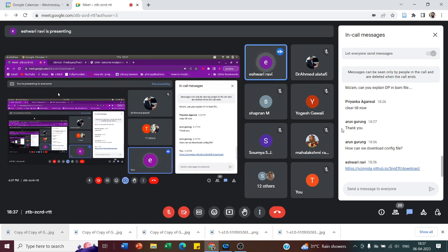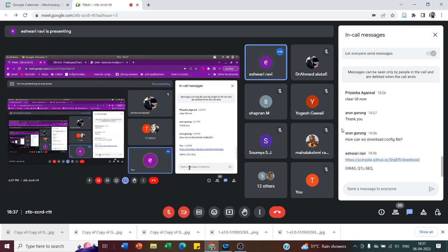So that's the end of whole genome sequencing until the annotation part. There are further steps. Some want to do GWAS. Some applications can be for genome-wide association studies. Some can be QTL. Then some might want to filter out all the variants and do a phylogenetic analysis also. But these are all different downstream analyses. But the first major analysis is whole genome sequencing, where you obtain variants and understand them.